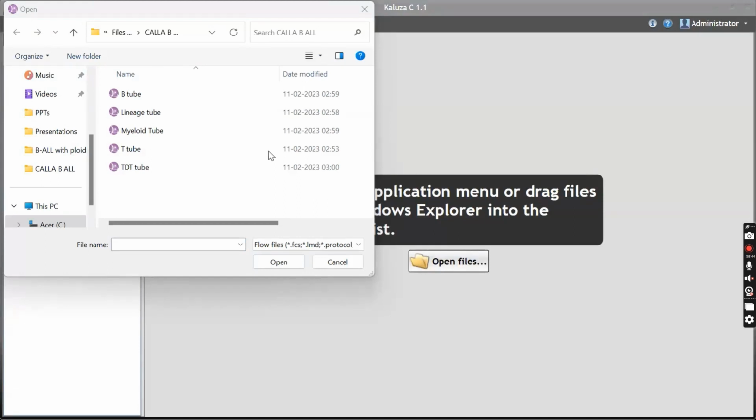So it is very useful to exclude them from the blast. And B-ALL can apparently show CD66C. That aberrancy has been correlated with cases known to show hyperdiploidy status. So when a B-ALL is expressing CD66C, it is likely that the blast population can be hyperdiploid. CD11b again is just to see your neutrophils, and it is very useful as a monocytic marker also.